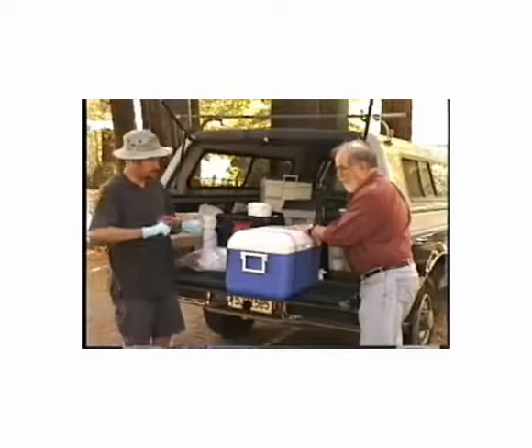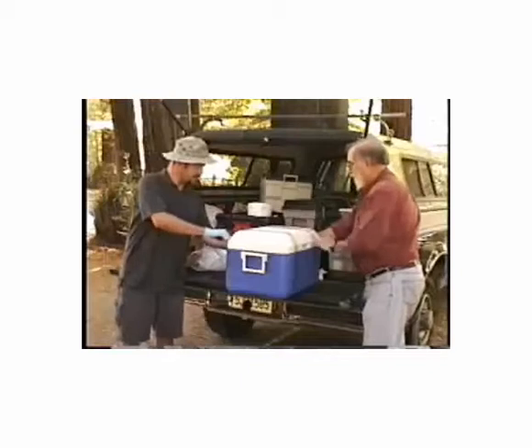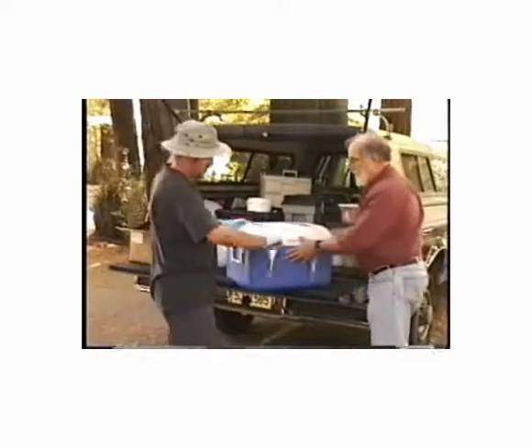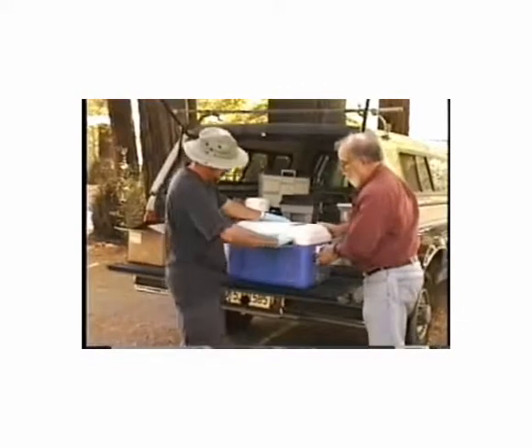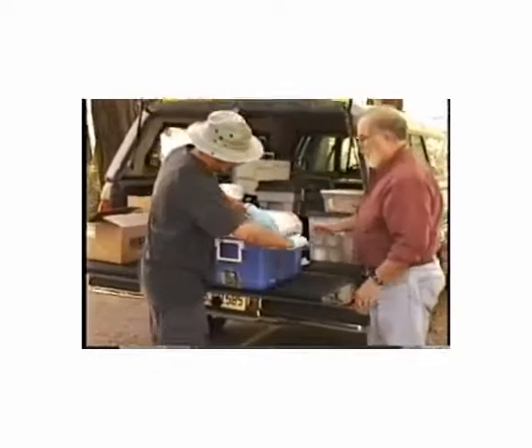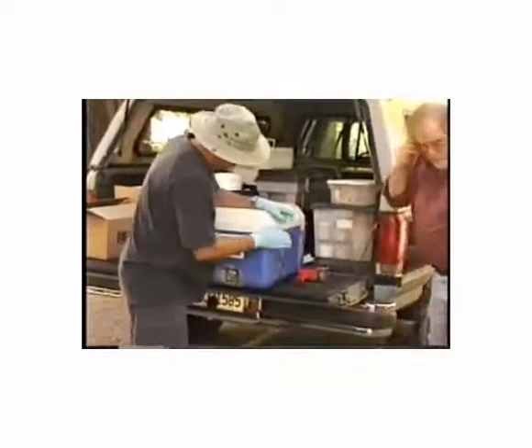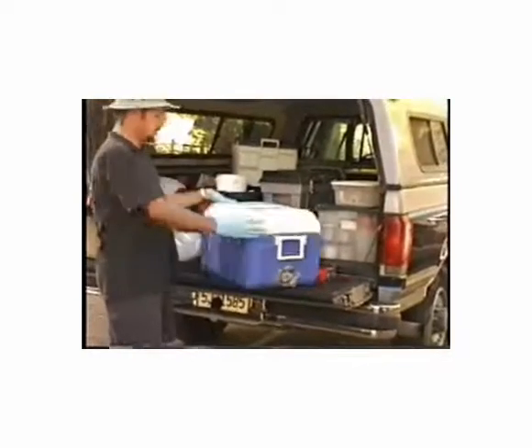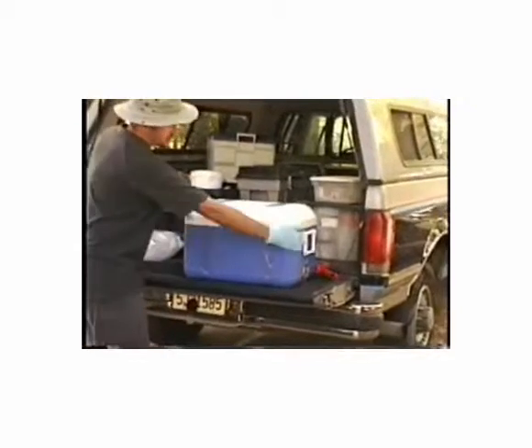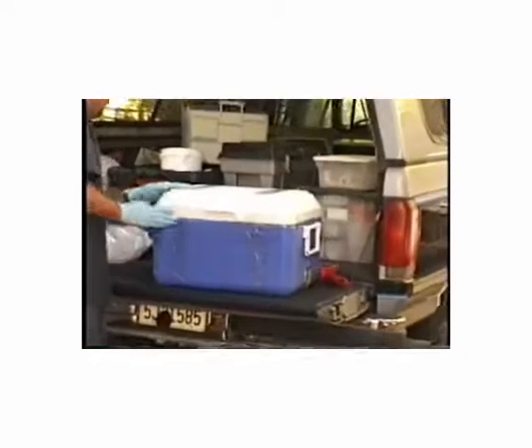We also want to tape around the seal of the cooler just to ensure that no water is going to leak out. The cooler is then taped closed securely, make sure all the tape is fastened.